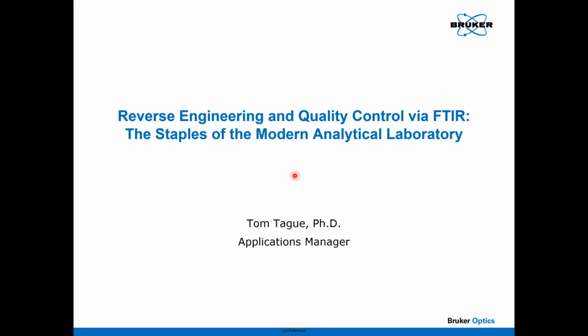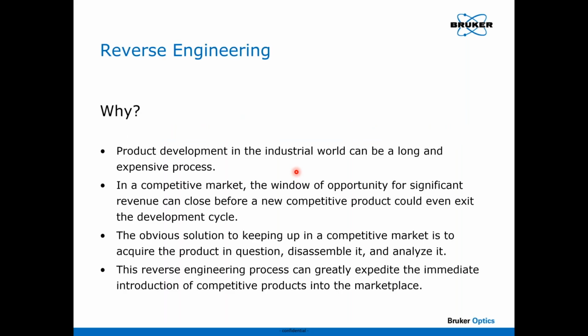So then we think, what is added by using infrared spectroscopy? And the answer is specificity. There is no more valuable or important technique you can use that gives you very specific information. The reason for that is every molecule has its own fingerprint signature in the middle infrared region of the spectrum. And that leads us to: okay, now we know we want to employ infrared spectroscopy.